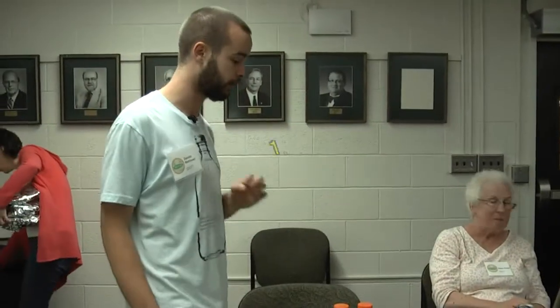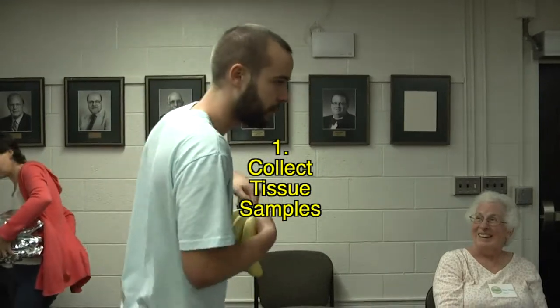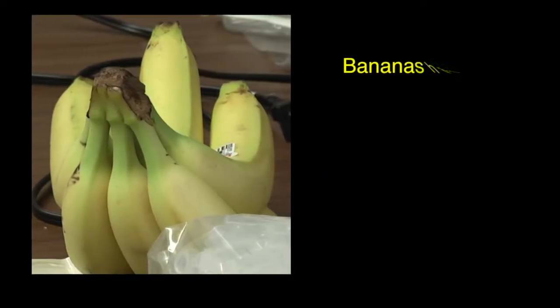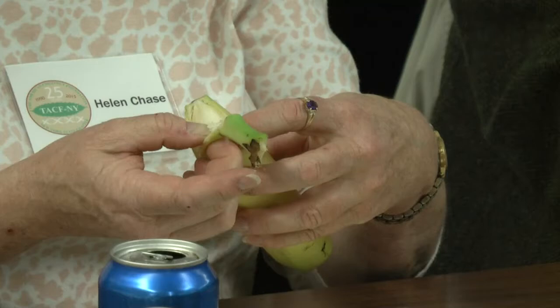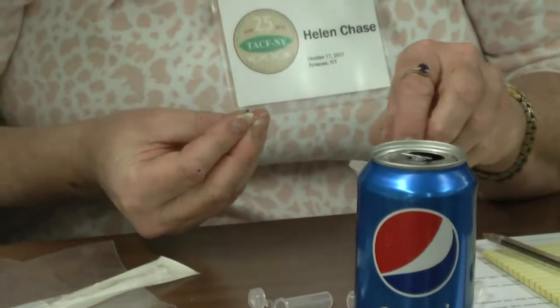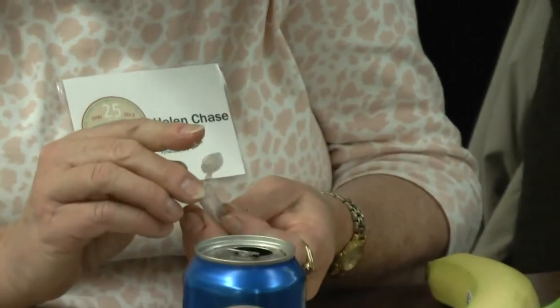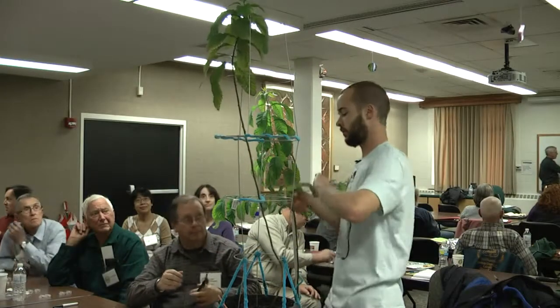What we're going to need to do first is collect our tissue samples. So I'm going to pass out a bunch of bananas. If you just put a little piece in both of your B tubes, so B plus and B minus, and try to do a little bit of an equivalent size if you can. Yeah, that's perfect. So a piece of that size in each one of your B minus and B plus tubes. There we go.